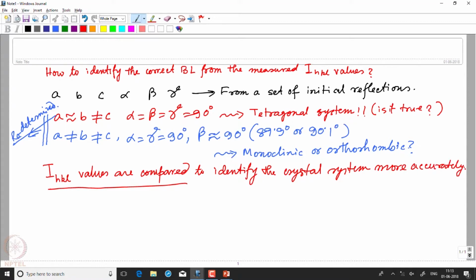At this point, after the data reduction is done, re-indexing of the unit cell is done once again, and then one looks at the statistics of all the HKLs and tries to see what kind of information can be found from those reflections.